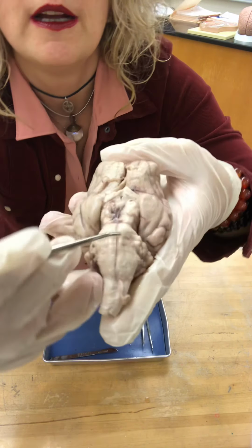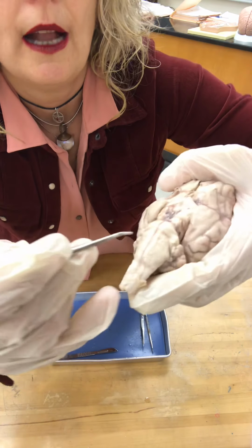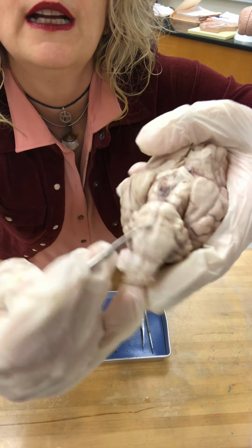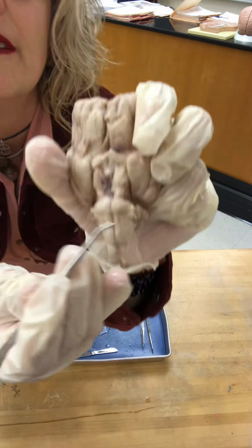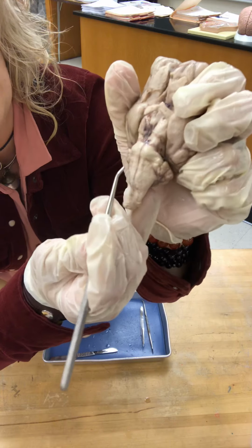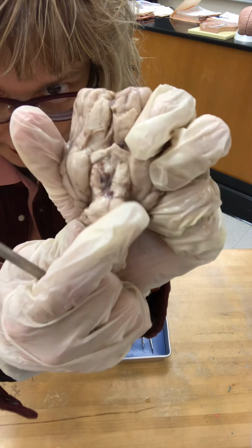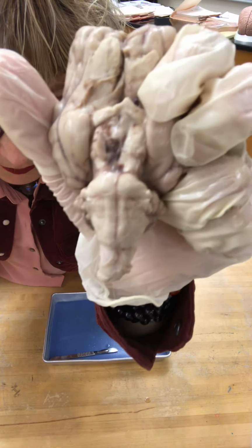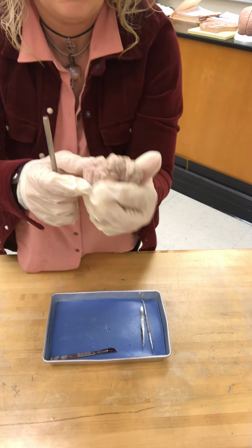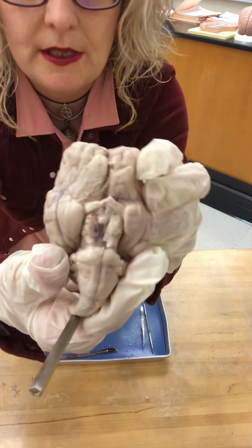This here, that little bulge right there, that's the pons. And then here is the medulla. And wait, hold on. Let me make sure because I'm looking at a video. So midbrain, pons, medulla, and then spinal cord. Okay, so the really large enlargement here, pons, okay? What else? That's pretty much it that you can see on this side.